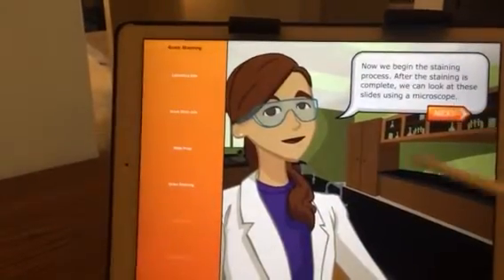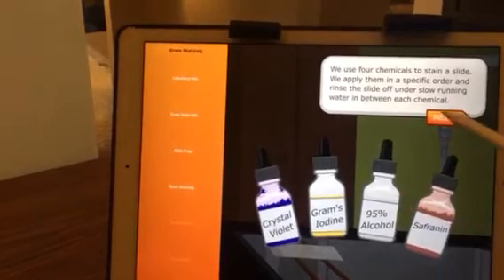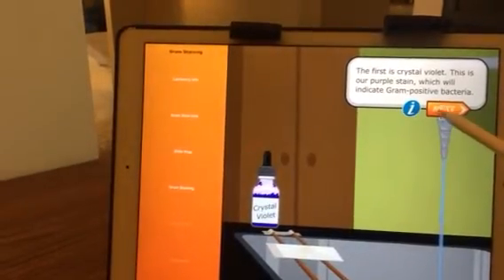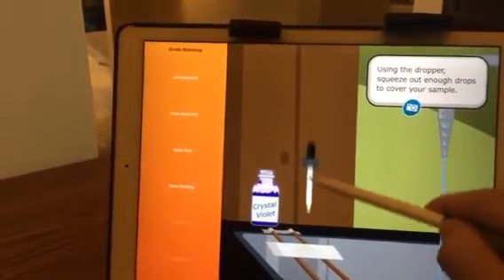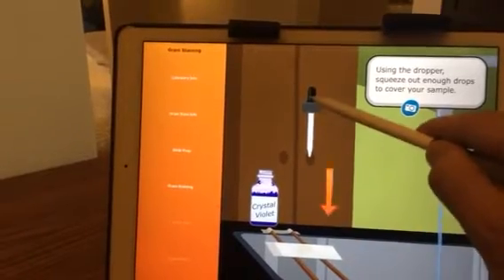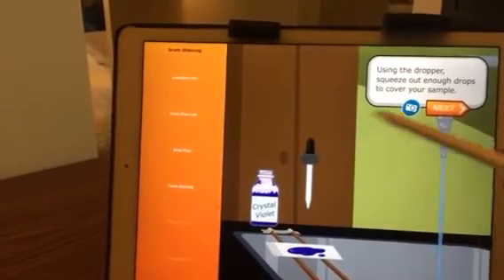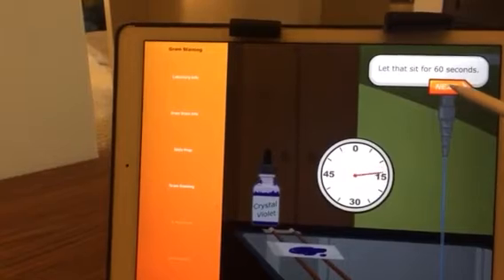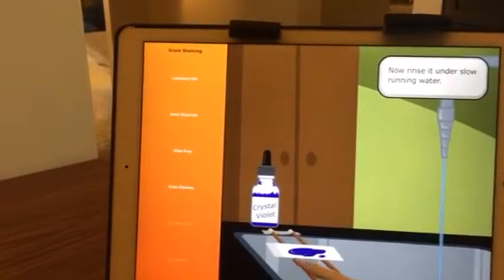Now we begin the staining process. We use four chemicals to stain. The first is crystal violet. Using the dropper, squeeze out enough drops to cover your sample. Let that sit for 60 seconds. Now rinse it under slow running water.